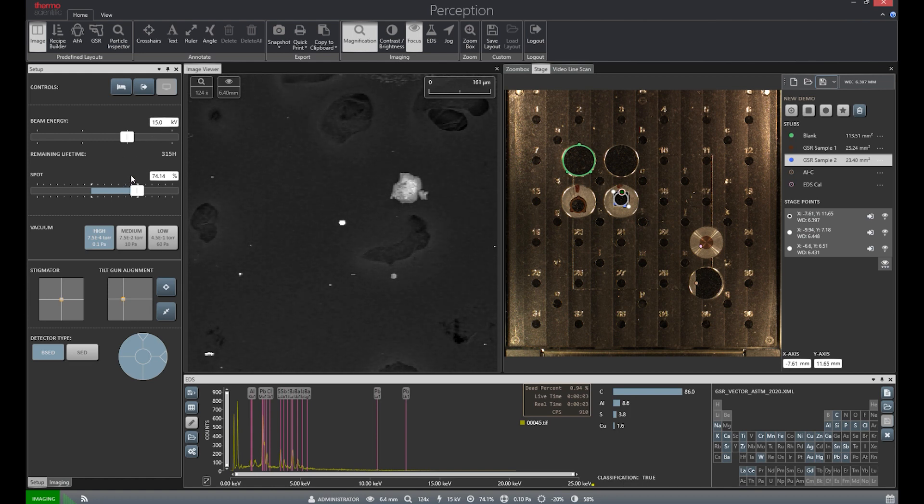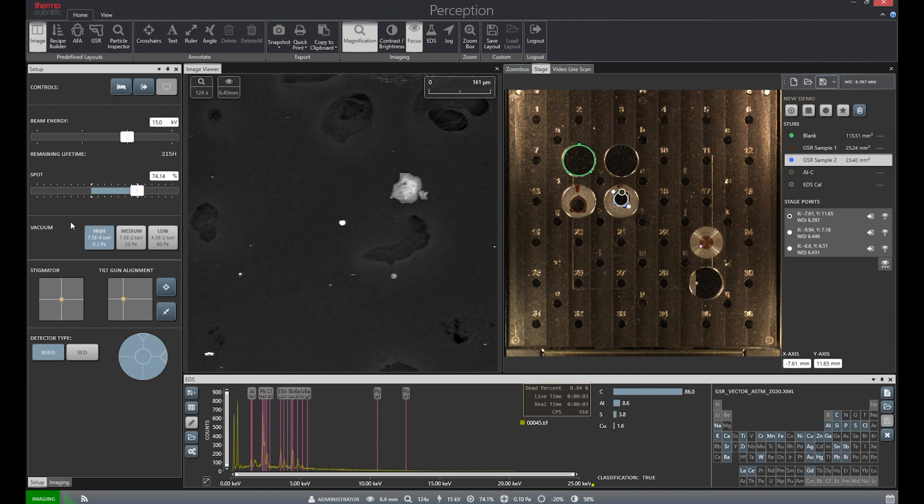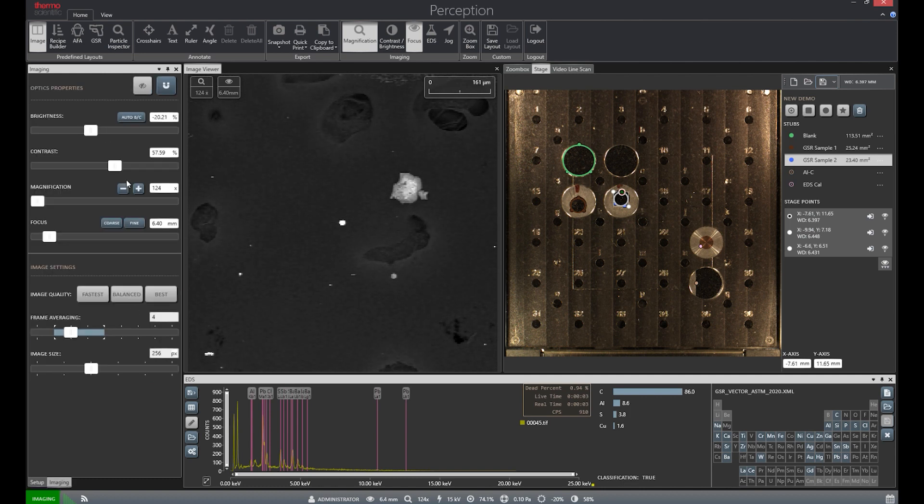The far left also contains controls for both beam settings, like accelerating voltage and beam intensity, and imaging settings, like magnification and focus.